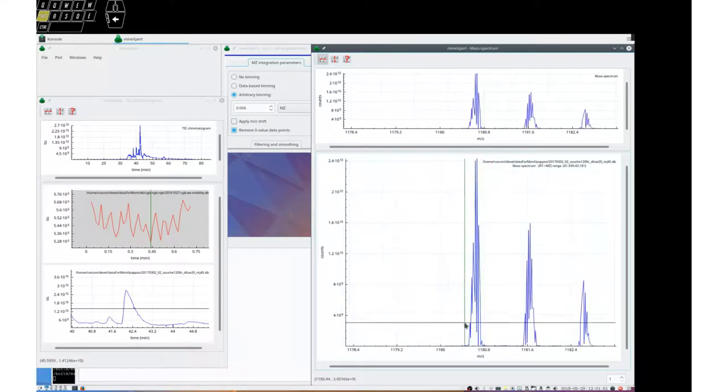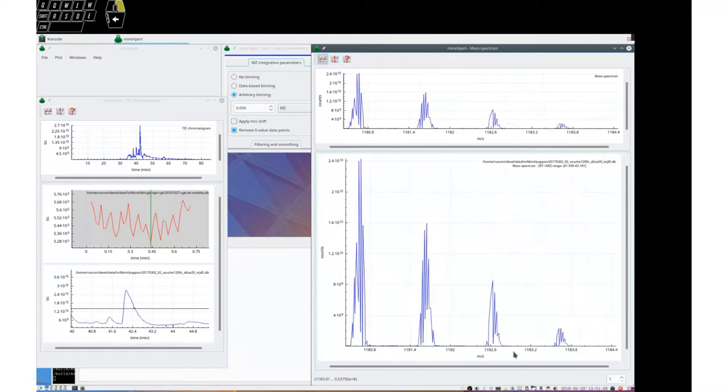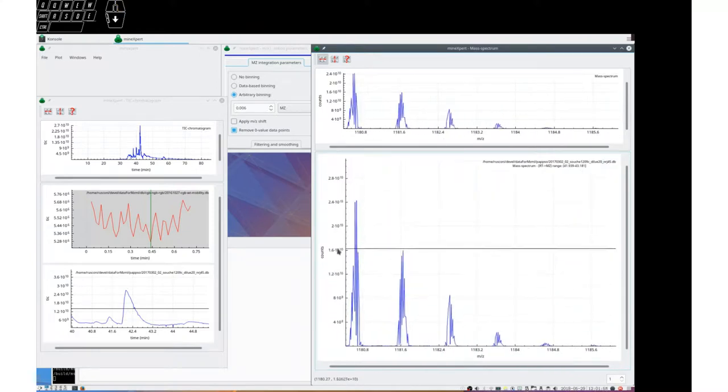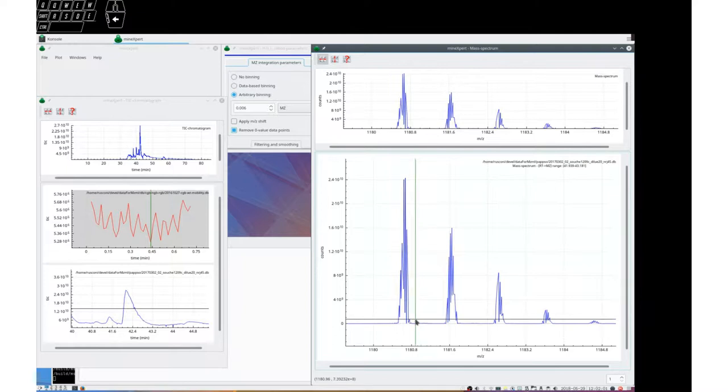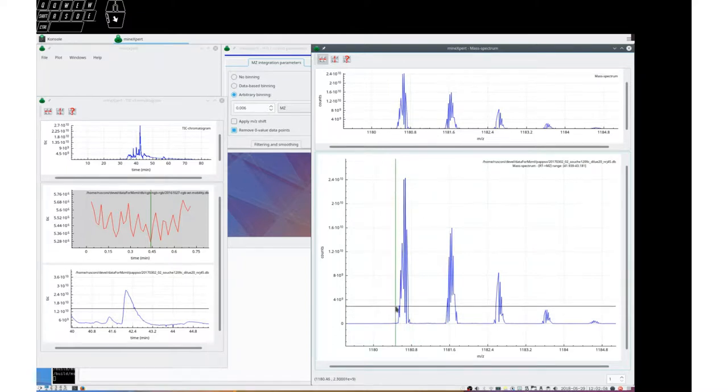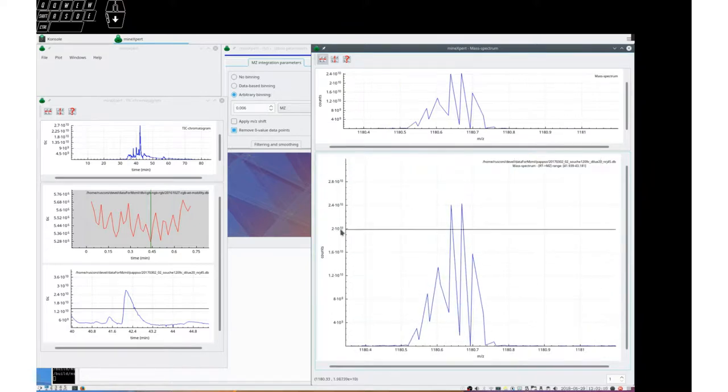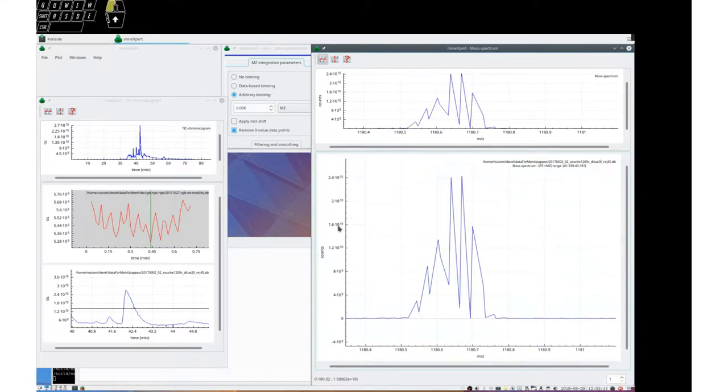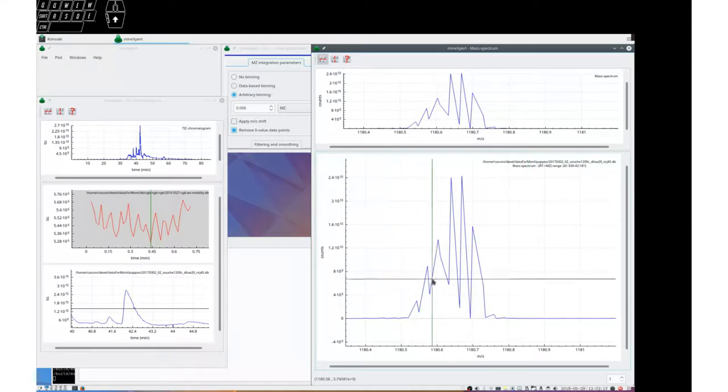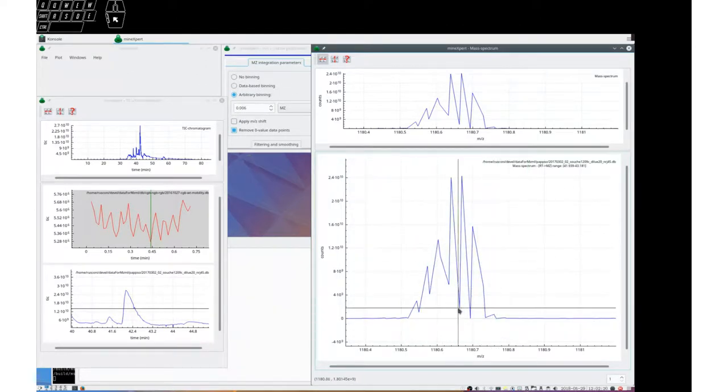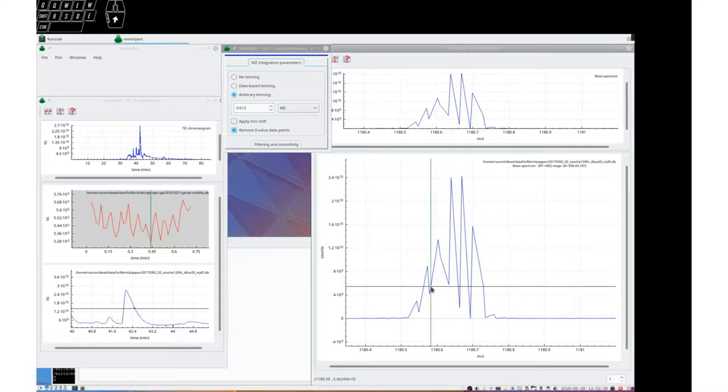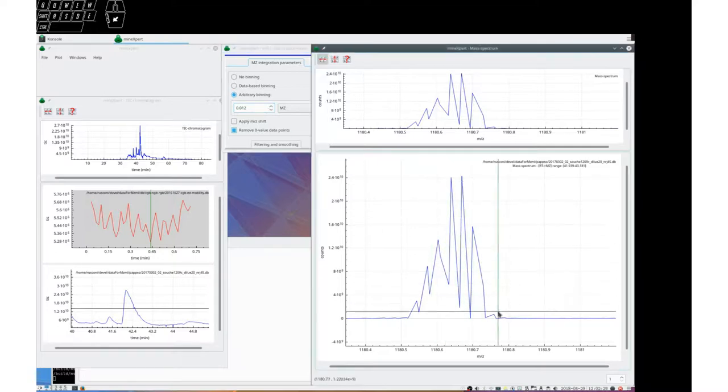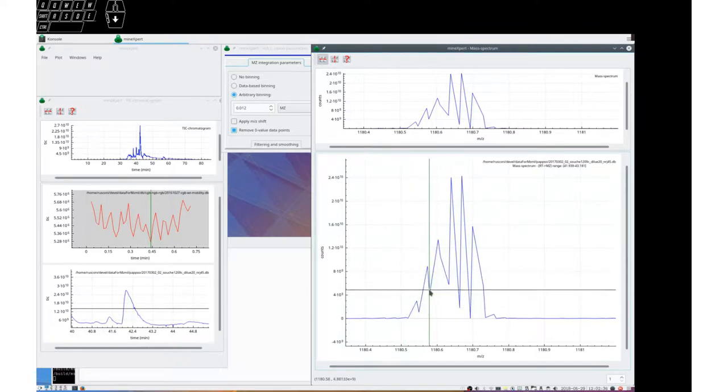What we see is that this is an isotopic cluster for a peptide, and a single cluster peak is made of many small points. The number of bins in this spectrum is too large. We should have three points in here. Let's now change this and go to 0.012 by increasing the bin size by a factor of 2.